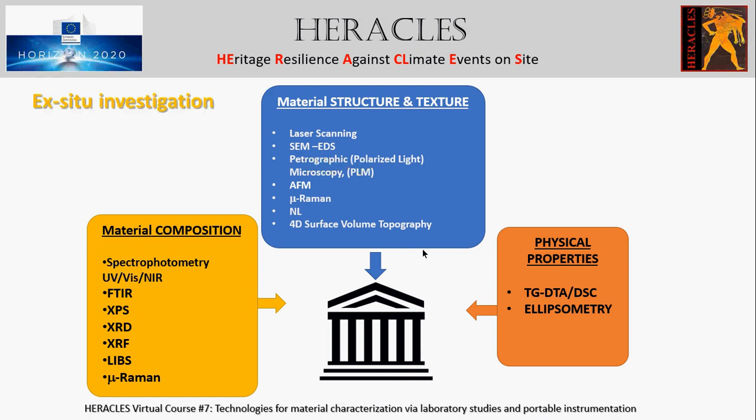In the frame of an accurate diagnosis, samples of unweathered, that is, original materials, weathered, and eventually treated samples are necessary for laboratory analysis in order to characterize and classify the original material, characterize, quantify, and rate the material degradation due to weathering, identify and quantify the weathering products, and characterize and evaluate the remediation and preservation treatment.